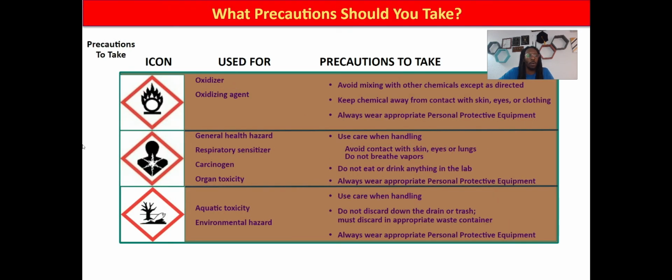Okay, we also have some more. You see this O with fire. Basically, this is an oxidizing agent. So these chemicals are usually going to be very reactive. You want to avoid, like with all these, skin, eyes, and clothing, wearing PPE.